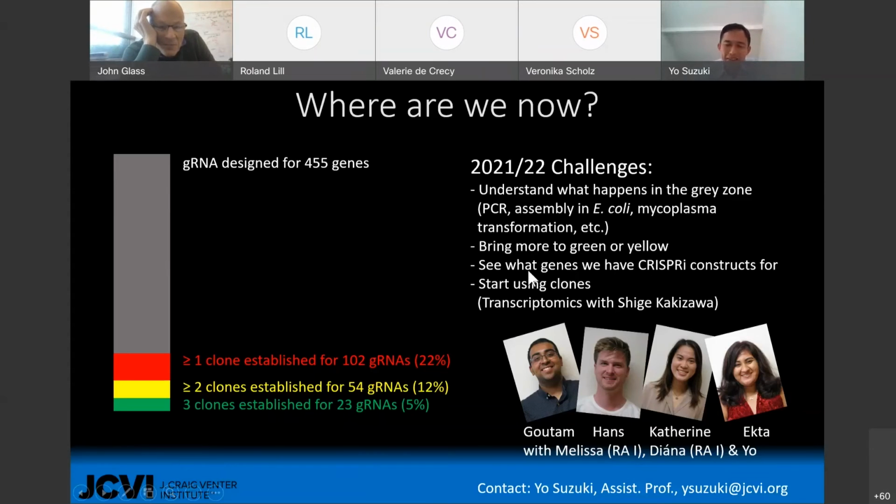I guess the first thing we would like to see is that the targets are repressed with CRISPRi, and we want to see what other genes are up or down regulated, and that will start to help us define the genes of unknown function in these cells.